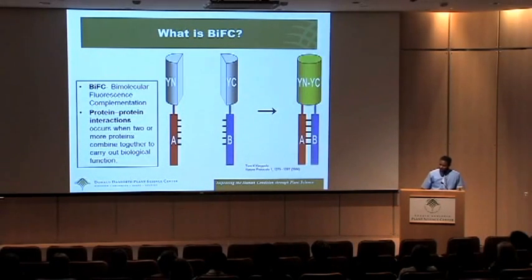microscope. So what is BiFC? Bimolecular fluorescence complementation is a method typically used to validate protein-protein interactions. So protein-protein interactions occur when 2 or more proteins combine together to carry out a biological function.